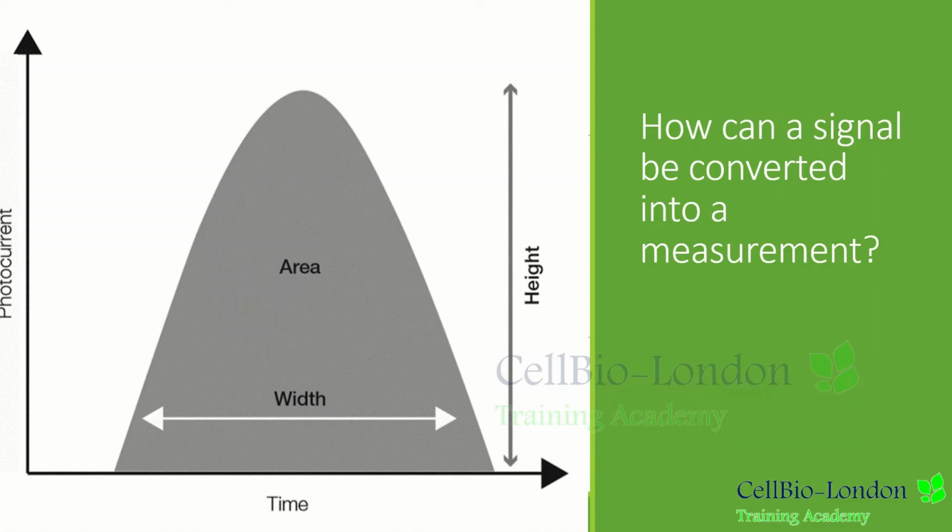As the particle enters the laser beam spot, it will generate scattered light and fluorescent signals, which will ultimately manifest in a current of electrons from the anode of the detector, known as the PMT, the photomultiplier tubes, which are the detectors in general. The photons that hit the photocathode are thus proportional to the intensity of the scatter or fluorescence signals generated by the particle.